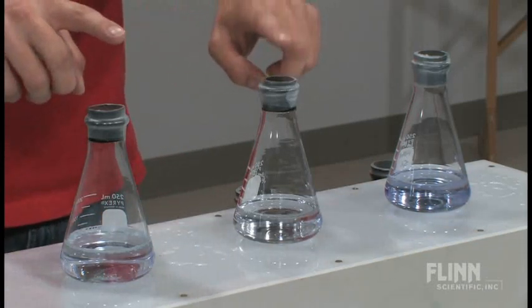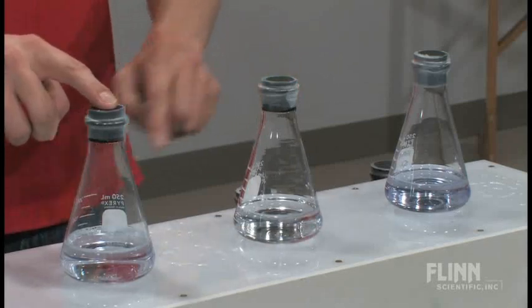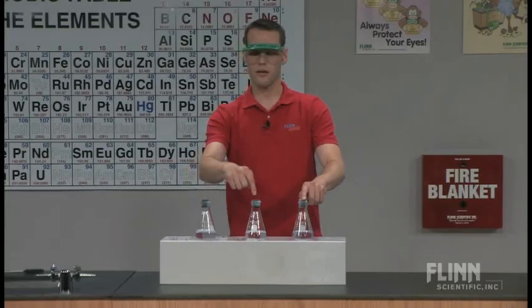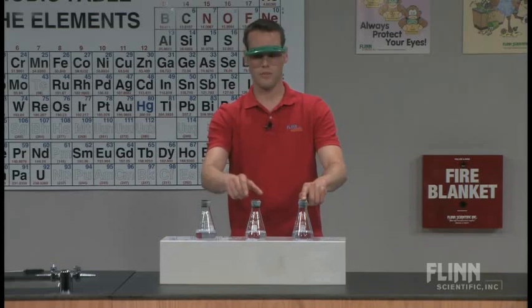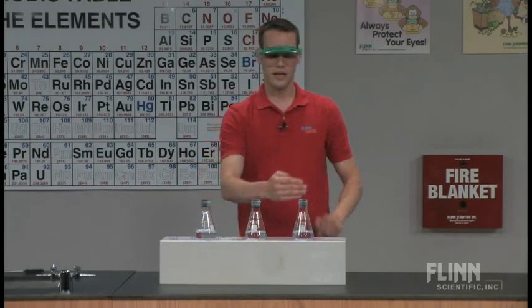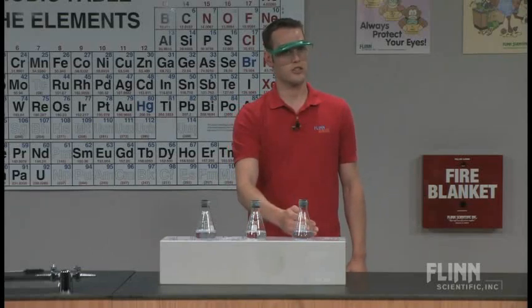So we can see that this one changed first, this one changed second, and this one still has a pale blue color in it. So what's happening? The most potassium hydroxide was in my middle flask, the second most potassium hydroxide was in my side flask, and the least potassium hydroxide concentration was over here.